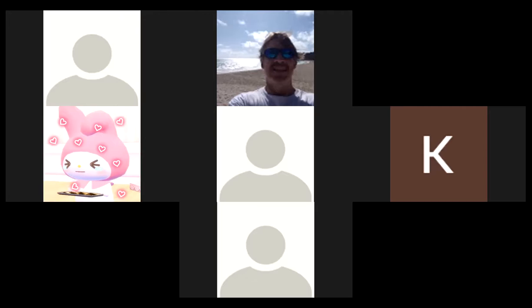Let's start. So this lab is different and it's probably going to require a long pre-lab lecture. We have a little bit of the energy from chapter 6, the electromagnetic radiation, and so that's what this lab is about. The basics of the lab is not that complicated. The experiment itself.